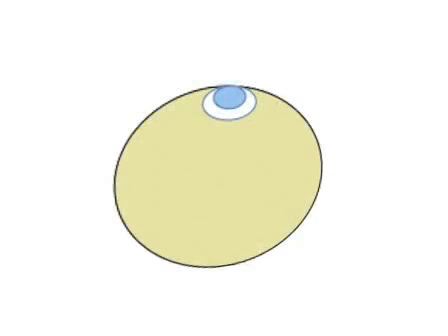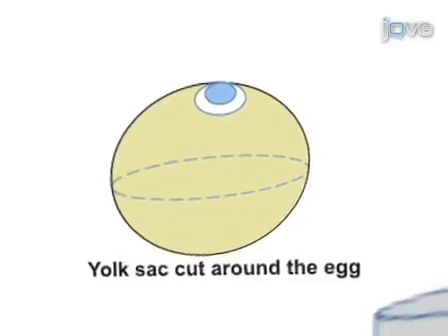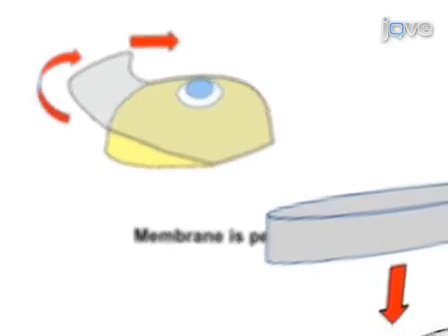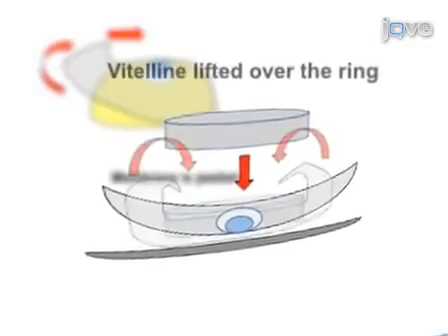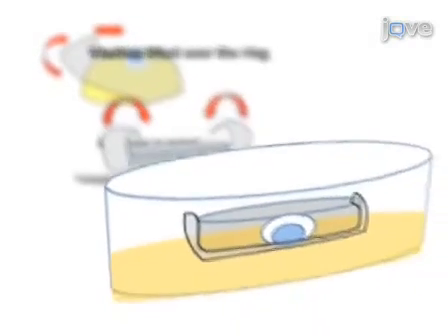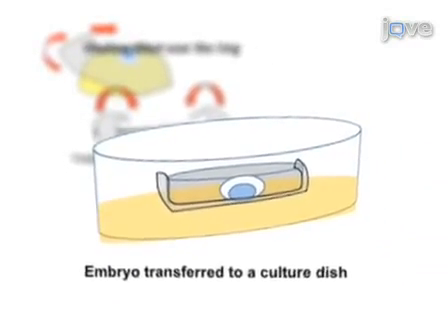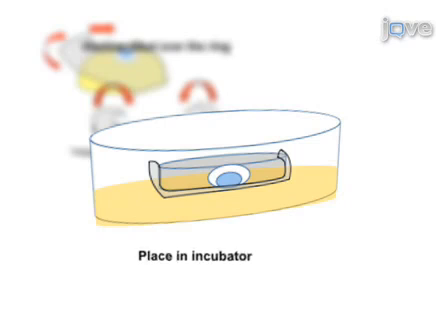This procedure begins with isolating the egg from the shell. The yolk sac is cut around the egg and the membrane is peeled and placed over a watch glass. A ring is placed over the embryo. The vitelline membrane is lifted over the ring. The embryo is transferred to a culture dish, which is placed in a culture box and then into an incubator where the embryo is cultured.